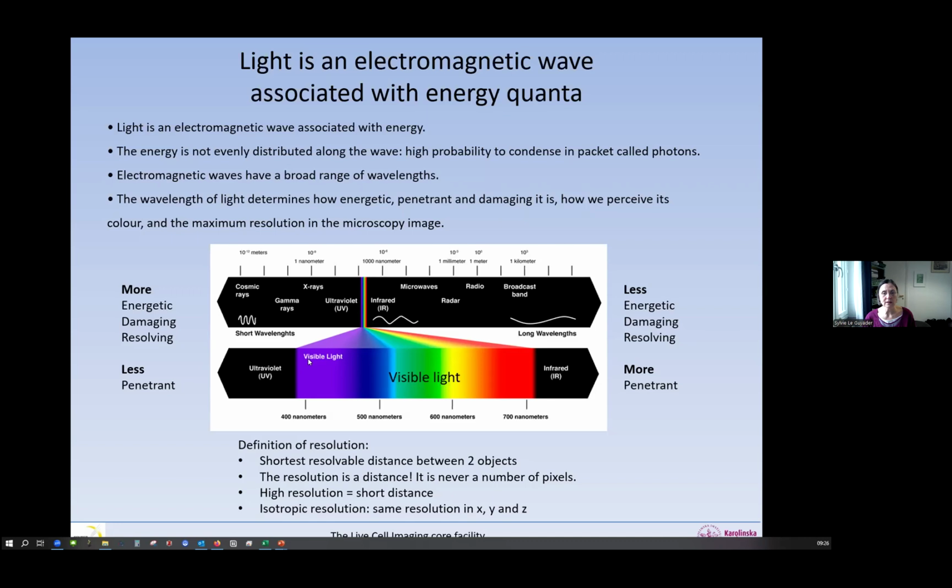So now in microscopy, we're mostly imaging in the visible range. We step a little bit in the UV for excitation, for example, and then nowadays we image more and more in the near infrared, so more towards the 800. So we've extended, but this is pretty much where we are staying in light microscopy.